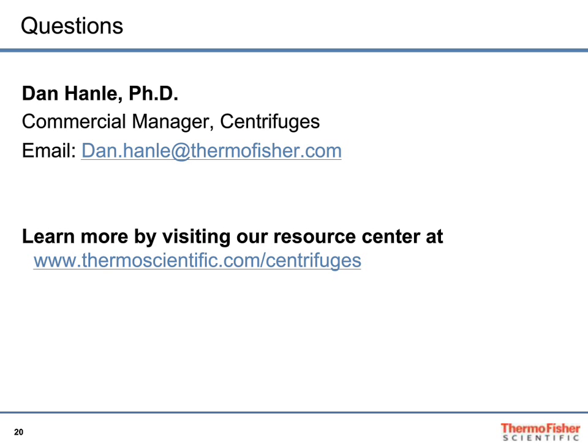Sometimes researchers can have a centrifuge go down, they can borrow the one down the hall, or they can move an application maybe to another centrifuge beside it. But my blood banking customers, they need their centrifuges fixed, and they need them operating. So they do a lot of preventive maintenance and that type of thing. But then it gets into the features on the centrifuge.